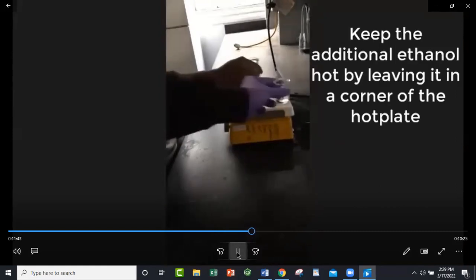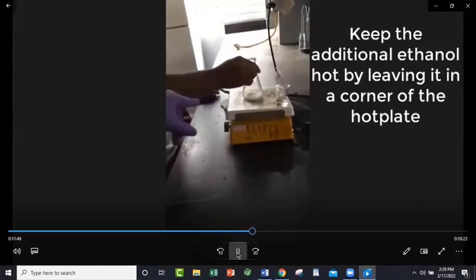But at the same time, go ahead and be swirling that. At the same time, you want to keep adding hot ethanol to it. The ethanol that's back here, when it starts heating up, it's already boiling. Go ahead and add some more. Add about 5 more mils. You can actually take that ethanol off. Keep that on. Keep swirling because it's hot.